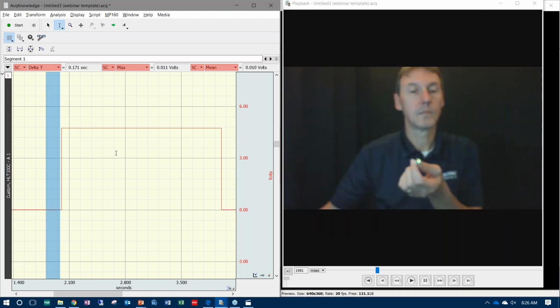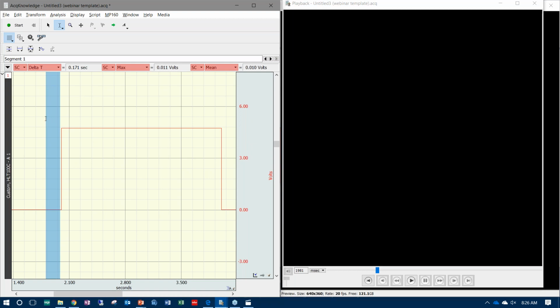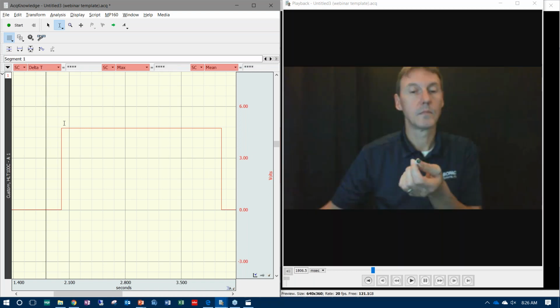Actually, I didn't do a very good job of that. And I'm going to redo that. So let's find that point where it came on, right there. And then I'm going to, there we go. So that's a little bit better. So this time period is 185 milliseconds. Okay, that's the difference between when the video is coming on and when the pulse went high.